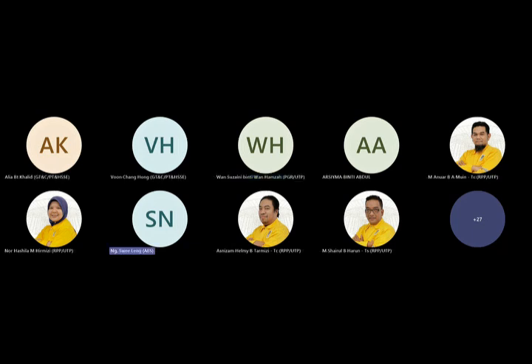OES, Nizam can always plot a calibration curve for gold at 10 ppb. The lowest point is 10 ppb, then 50 ppb and 100 ppb. No issue. You just need the LOD to make sure. ICP-OES is double-digit ppb. Meaning if you have ICP-OES, most elements you can run at 10 ppb.